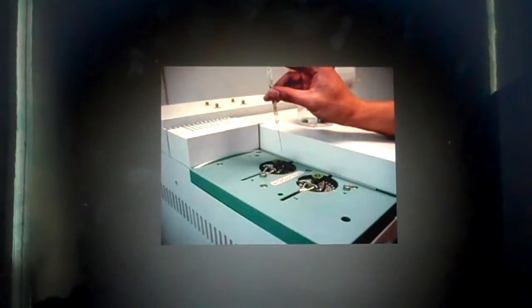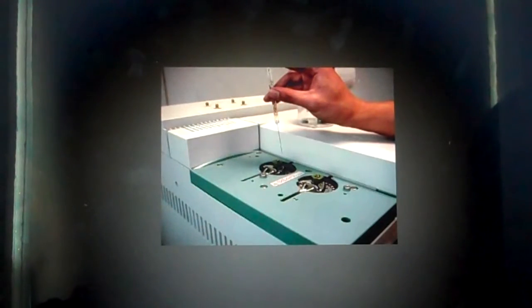When the carrier gas flows into the column, it carries the components of the mixture which was injected into the column. The components with a greater affinity, which is a natural liking, for the gas phase move more quickly than those with a greater affinity for the stationary liquid phase. After the mixture has traveled the length of the column, it comes out as separated components.